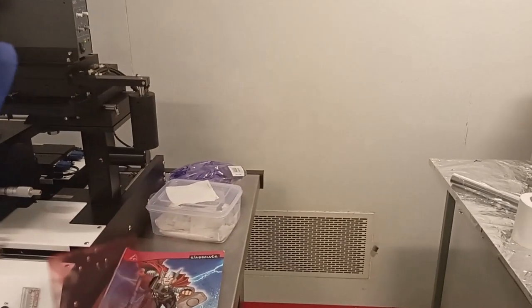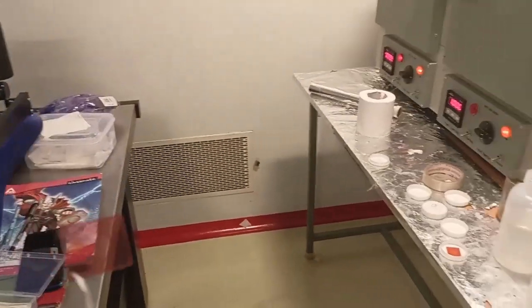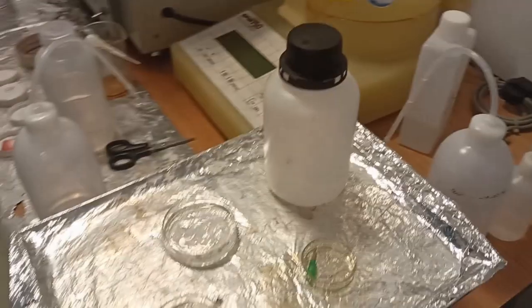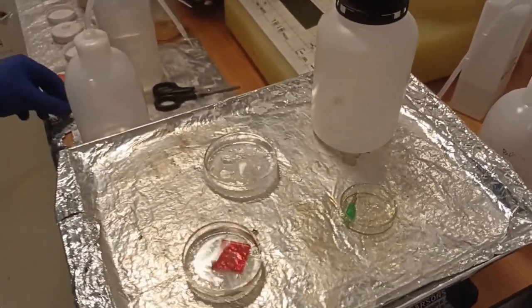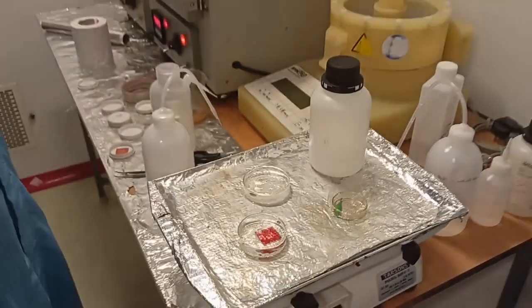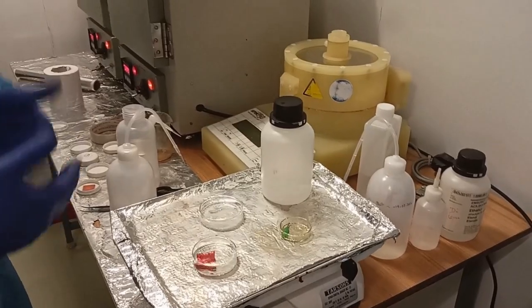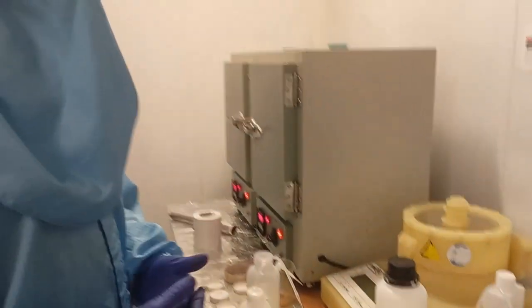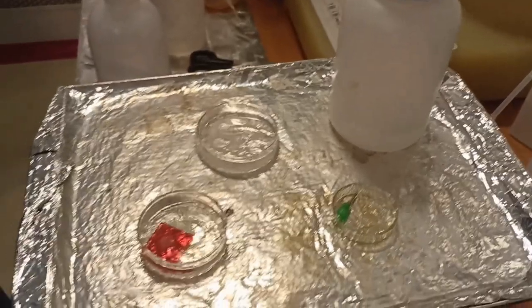You won't realize before developing where it was exposed. After developing, we can see. So for how many seconds are you putting it in solution? That we have to see, we have to optimize. The time will be different for different exposure times and different samples, but it should not take more than 5 minutes.